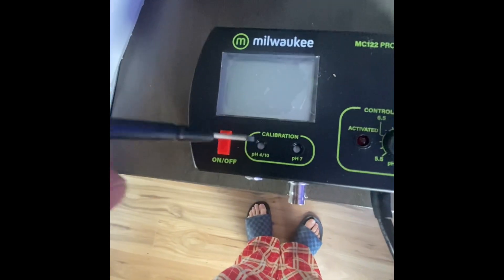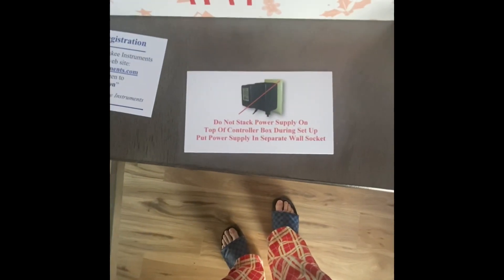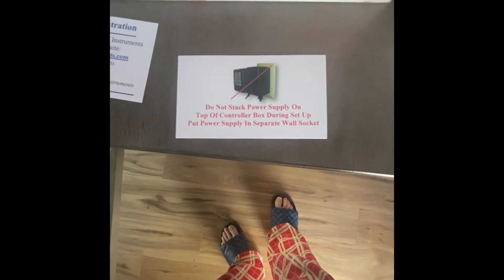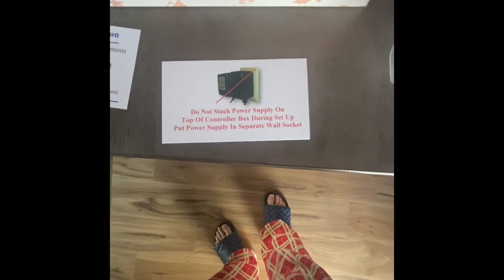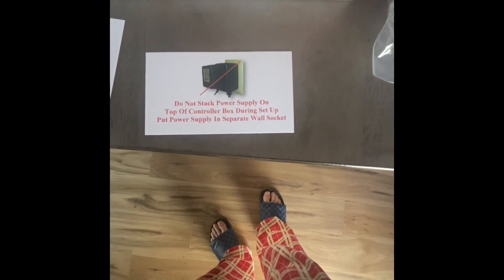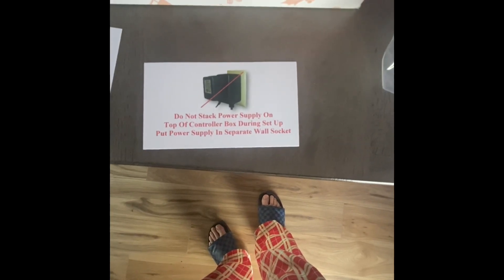And the little handy dandy screwdriver for making the adjustments as you calibrate. Another very important notice — they don't want you putting both power supplies in the same outlet when you're setting up. Maybe it trips the circuit or whatever reason, but they're telling you not to do it.